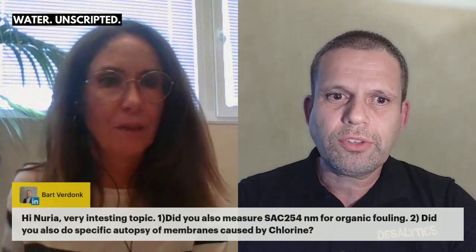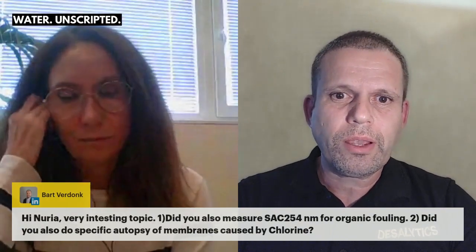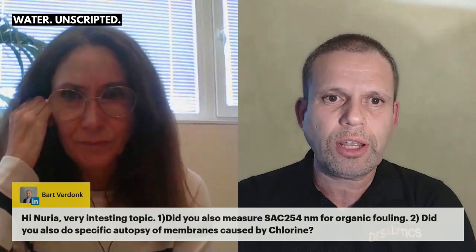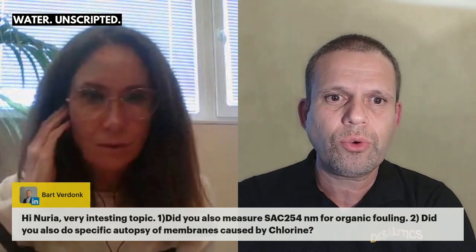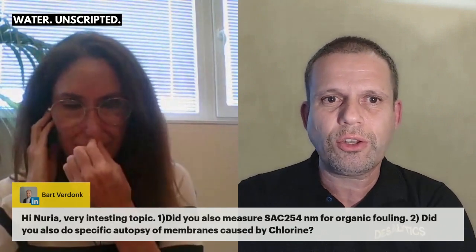Another question, thank you, Dr. Nuria. Another question from my friend Bart. He's asking if you measure the SAC-254 for organic fouling, and also if you do specific autopsies due to chlorine, do you test any chlorine damage?